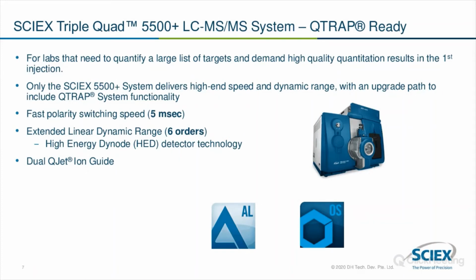And what you are seeing is that it is controlled by Analyst software, and data can be processed by Sciex OS mass spec software. Next slide, please.